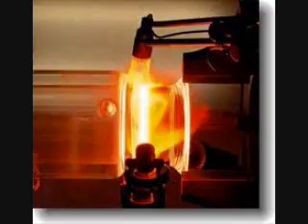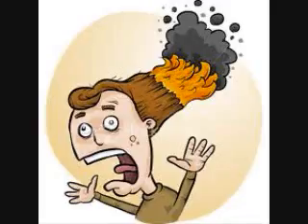The fifth and final rule used in the science lab is heating substances. Students will not be allowed to operate a hot plate by themselves. The use of a hot plate is only allowed when the teacher is present. When using heat or flames, this will relate to the first rule, and students will have to make sure all hair and clothes are secured.